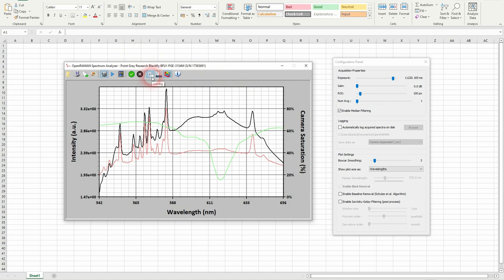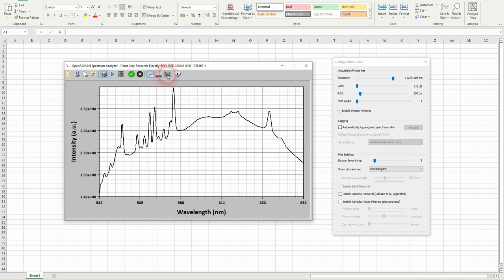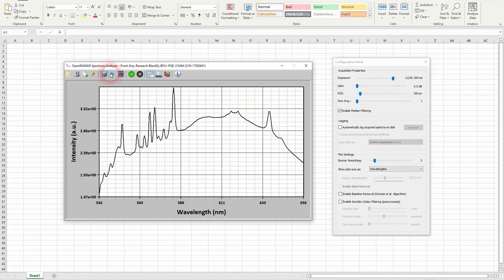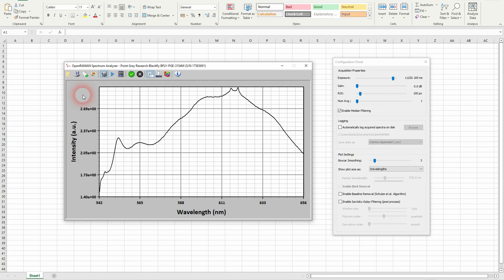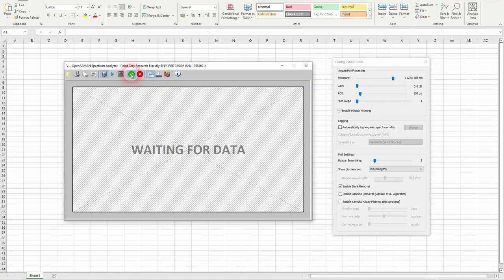So I will switch off the laser and I will take one more image. So that's the ambient noise and I will take a blank to cancel it.